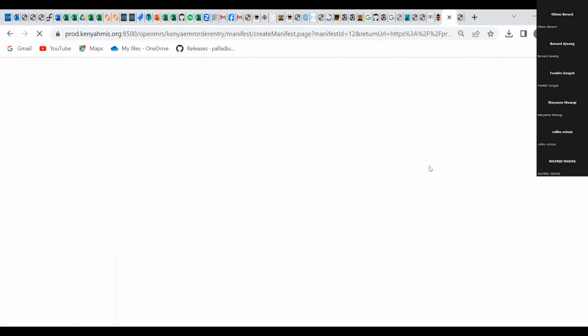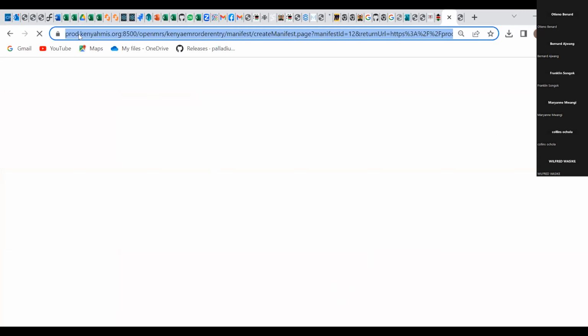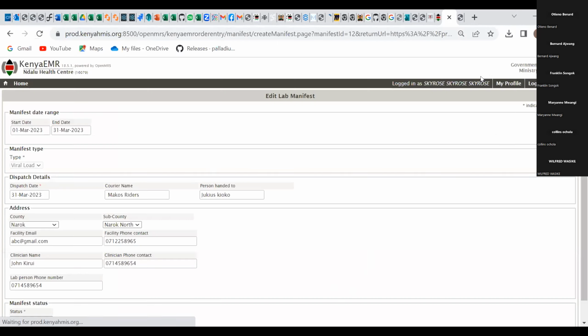Apologies for my system, it's a bit slow. So it takes you back to the lab manifest, and you can edit the lab manifest.